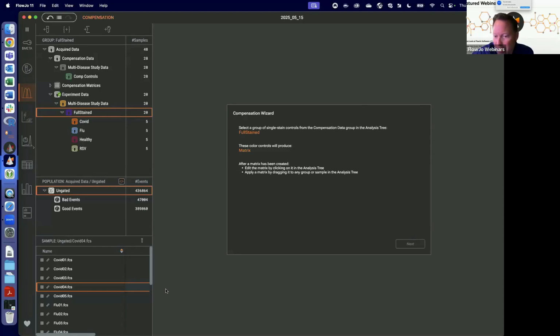Oh, QC on non-Unicode characters. I would assume no, but I am not positive. I would assume if it's not Unicode, we're never going to read that file. Okay, good advice from Will. Performance on a server: you'd have to set it up on the server, and it'll depend on the quality of your server. More is generally more. We generally recommend at least 32 gigabytes of RAM, which is true for most modern computers, even a laptop at this point.